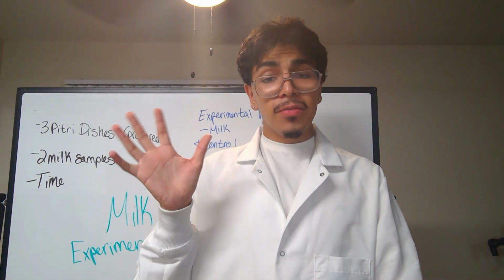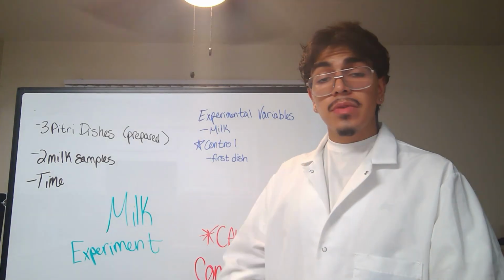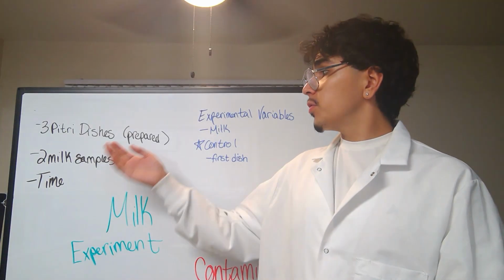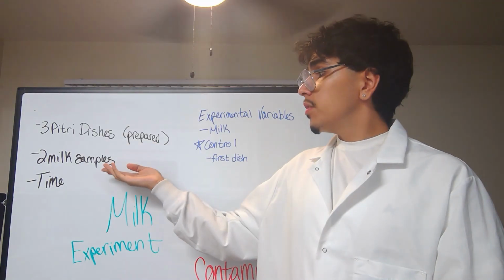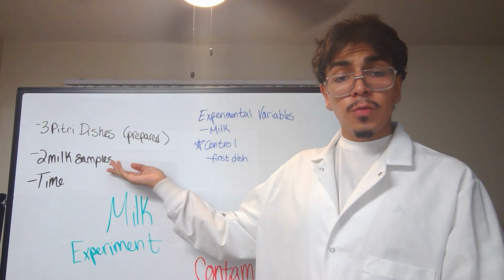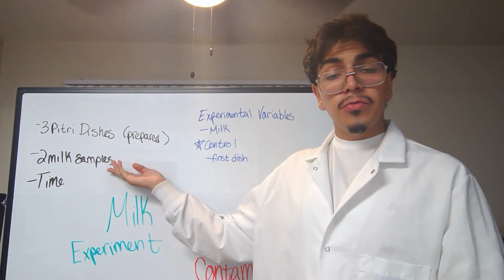Hello, my name is David, and today we will be doing an experiment with milk. For today's experiment, we'll be using three dishes prepared with agar, two milk samples, one of which was left outside in the summer heat for about a day, and the other was left in the fridge.